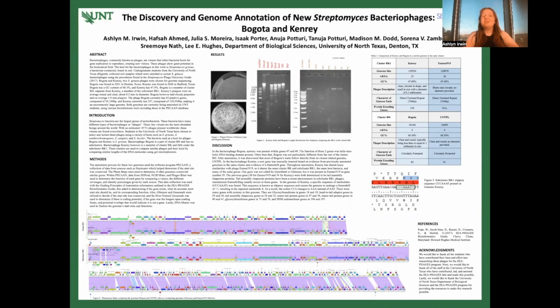Hello all, and welcome to the discovery and genome annotation of new Streptomyces bacteriophages, Bogota and Kenrey. The hosts that we were able to use for these lovely bacteriophages are going to be Streptomyces griseus.